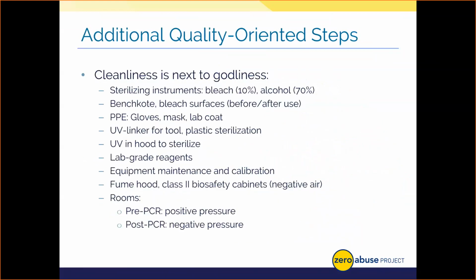Now, there's a lot of other things that you can do in the laboratory to maintain a sense of quality control and quality assurance. Just some of these, very briefly. We were using personal protective equipment before COVID even hit. You always change gloves and masks in between items. We always keep those on so we don't shed our DNA onto items.